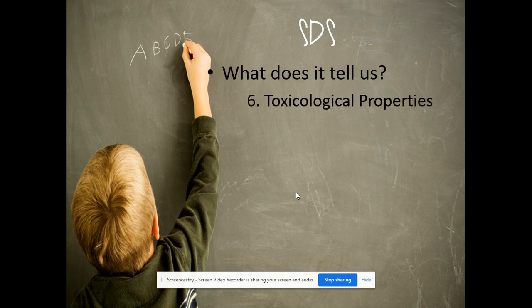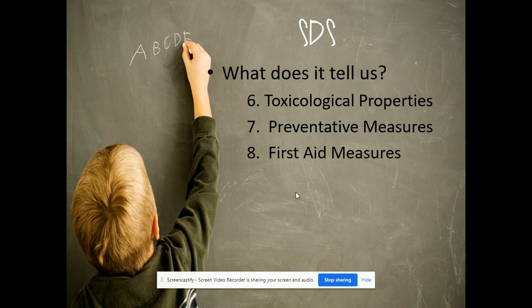Toxicological properties. So what about it makes it toxic? Okay, preventative measures. How do we avoid getting sick or avoid having an accident? Okay, first aid measures. What do we do if we do have an accident? And then, who prepared it?